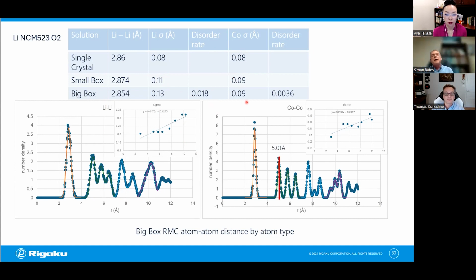If we look at the layer spacing between the individual metallic sheets, now we're at about 5 angstroms. So it's increased about 0.1 angstrom going from cobalt to NMC. So we've opened that up. We've increased the mobility capability of the lithium. Now, again, this is part of the design considerations of new cathode materials. And PDF without any complex analysis can give you that straight away.